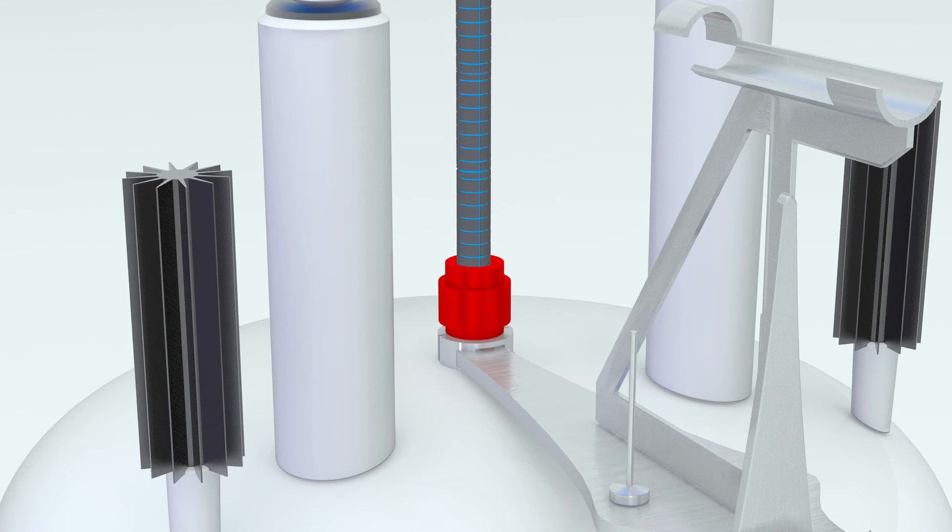Simply lift the flow tube assembly and the transfer lines and secure to a clamp stand.